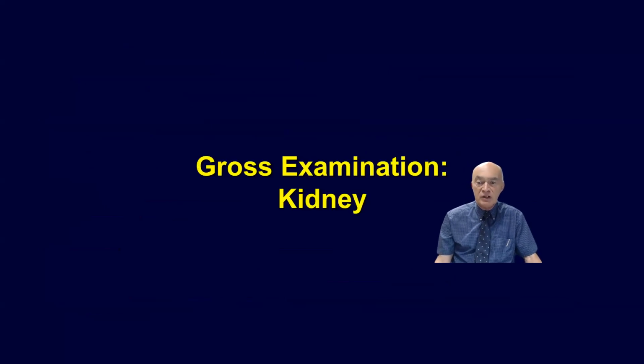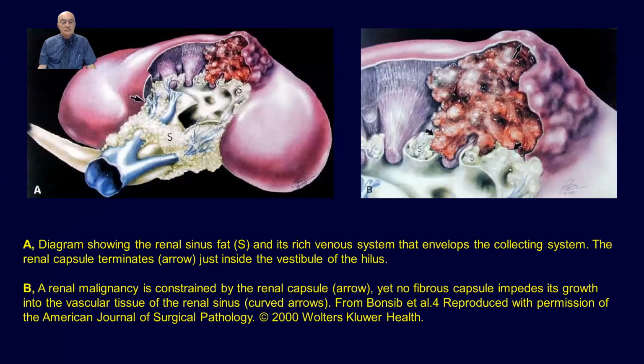We're going to start with the examination of the kidney. This is a graphic cartoon taken from the same CAP protocol. The presence of, in this particular case, tumors in the parenchyma, the renal parenchyma itself, and also tumors that can be present in the pelvis. And then different possibilities that we can find in regards to the extension or the invasion of these tumors into different areas, either the perinephric fat or the sinus fat and the area of the pelvis.